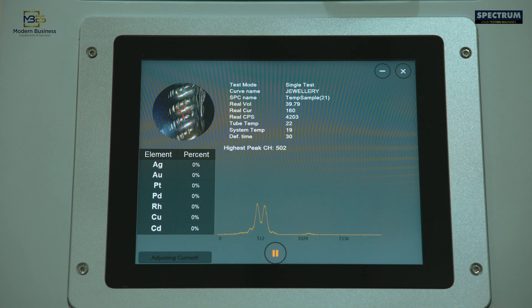It gives individual accuracy readings as well as the average results of the tested metal.